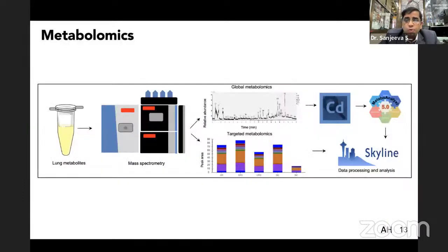approach. So let's say you have a biological sample, tissue or cell lysate, from which you want to do proteomics. You're going to extract the protein out. Why not also extract the metabolites out of the same sample? For example, if you're doing methanol-based precipitation, you can use the same sample, some part for the protein, some part for the metabolite analysis, right? How powerful that could be if you are integrating the data from the same sample.